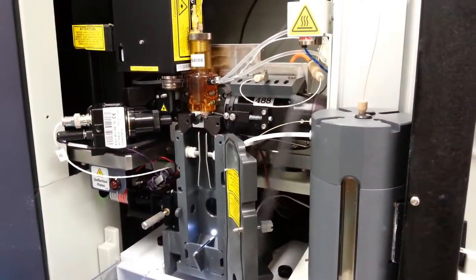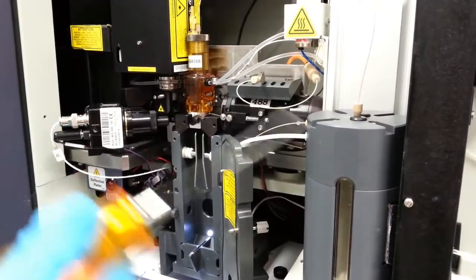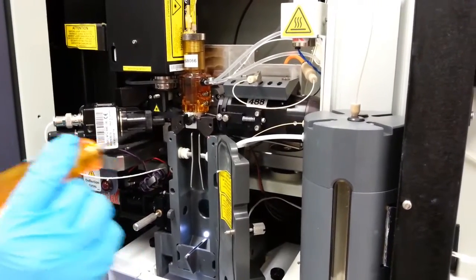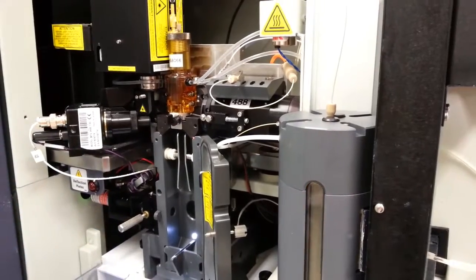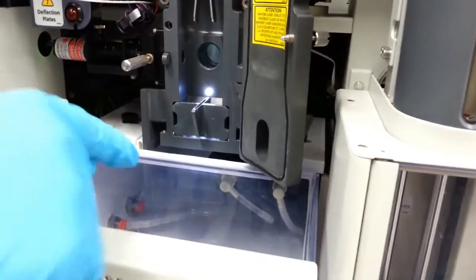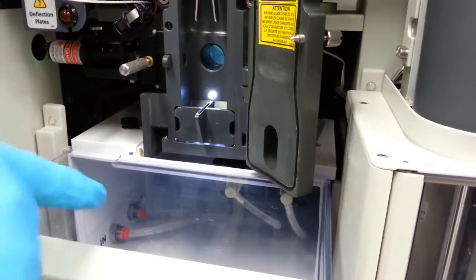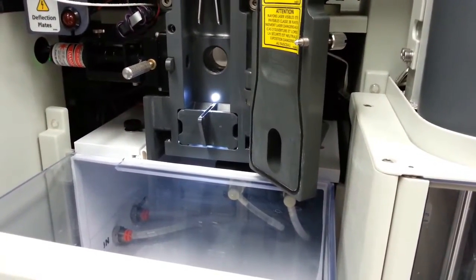They read the cells as they're coming through in single file. If a cell that you have identified as one you want is in a particular droplet, those cells are deflected either left or right and into a bunch of tubes that I haven't inserted yet, but they will drop into there as pure populations.